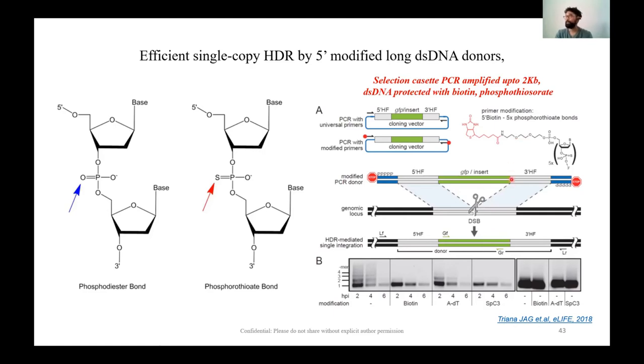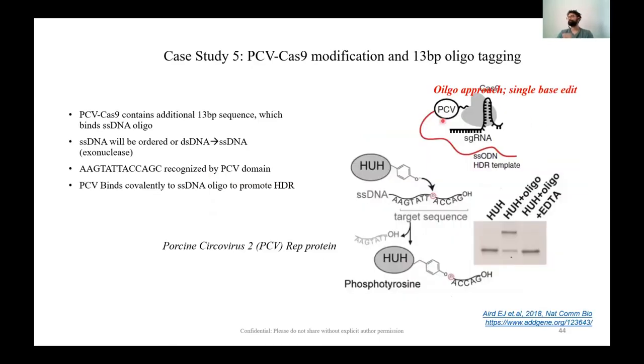And this ensures really that your oligo stays in close proximity and ensures good efficiency for a primary edit. You can even go up to a 2 kb version, right, if you amplify your HDR template for this oligo with the Cas9 monoavidin and biotin and phosphorothioate bond conjugation method. I've tried it successfully and it does work in primary cells, but I'll talk about it later.